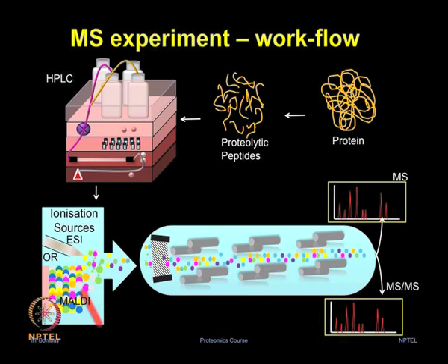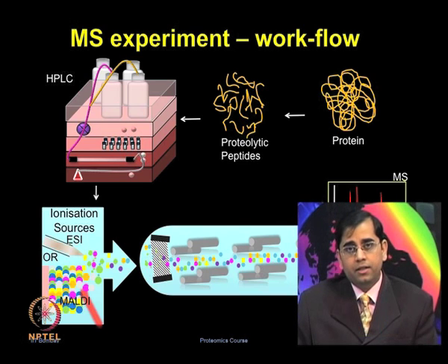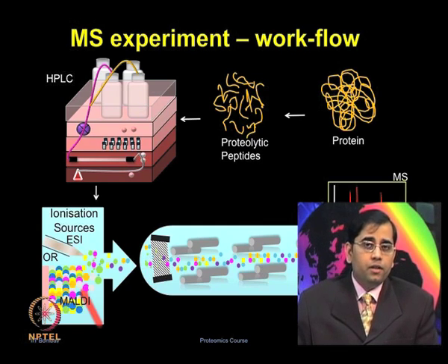First of all, you can pre-fractionate your sample by using liquid chromatography, or one can also try different methods of pre-fractionation and then apply that for further MS analysis.